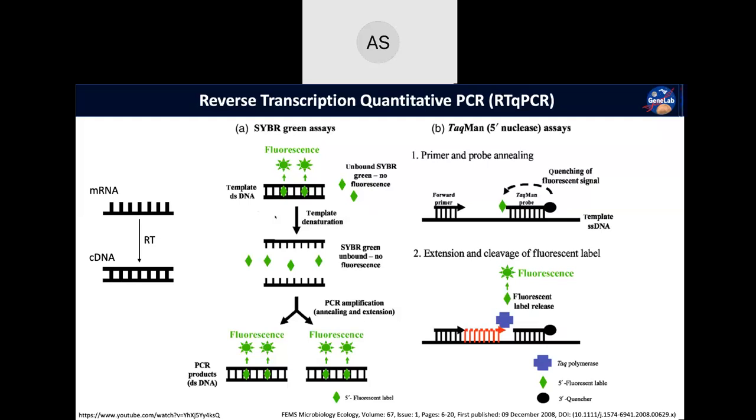It always wants to be double-stranded. So it has a possibility of folding up on itself, in which case, again, it'll make double-stranded DNA, which will cause SYBR Green to bind to it, even though a new copy wasn't made. So those are just some examples of off-target effects that you could see with the SYBR Green method.